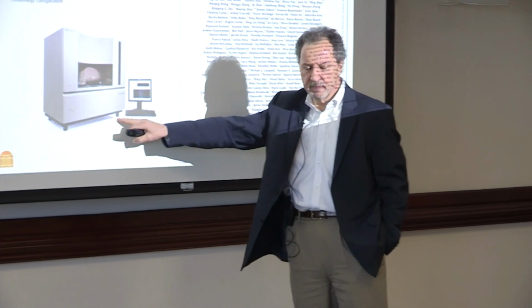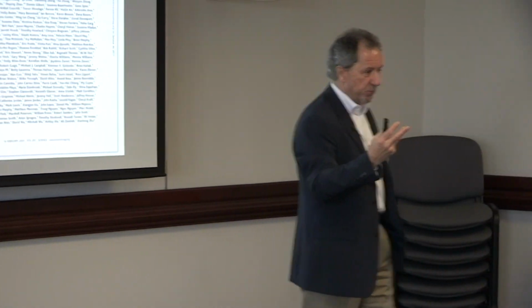So where does this all kind of funnel into something that's relevant to what we're interested in and also what Dr. Bienvenu and Dr. Root are very interested in, and that is, how do you exploit this to do things like Craig Venter did in terms of sequencing the genome? So Craig Venter sequenced the genome by using microscale technology. He actually used 300 of these and managed to sequence the genome in 3 years, despite the fact that Francis Collins had actually been at it with NIH sequencing centers for 7 years and still hadn't completed it yet. The new technology allowed them to expedite.